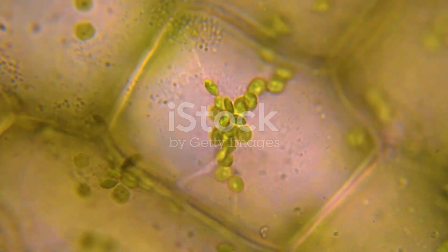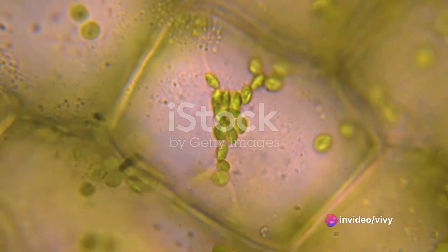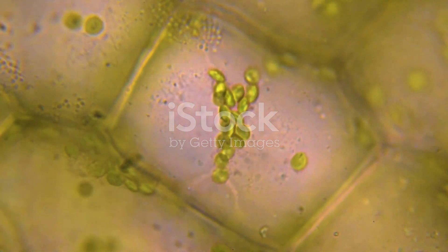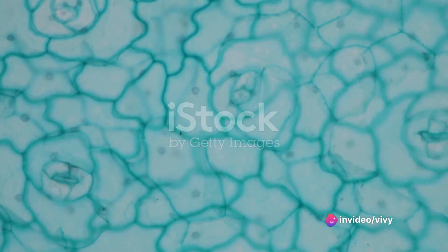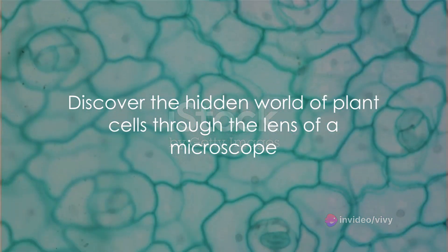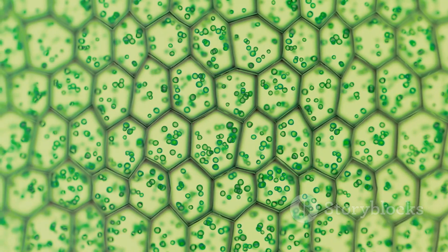To recap, the process involves preparing a thin section of plant tissue, placing it on a slide with a water droplet, covering it with a cover slip, and then observing it under a microscope — starting with the lowest power lens, then moving to higher power lenses for detailed observation. So, the next time you see a plant, remember that beneath its green facade lies a complex, unseen world — a world that you now know how to explore.